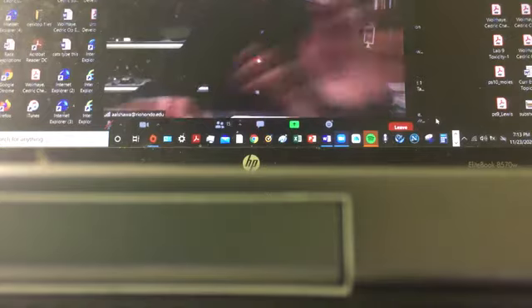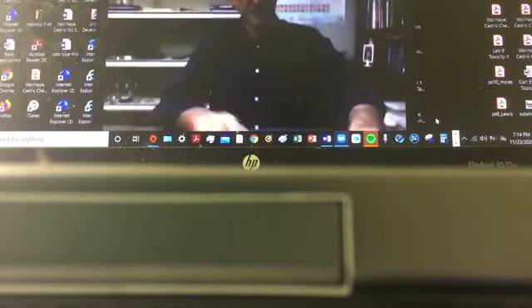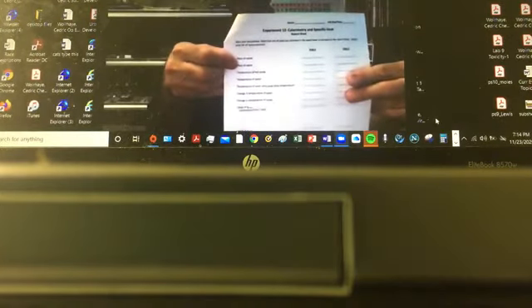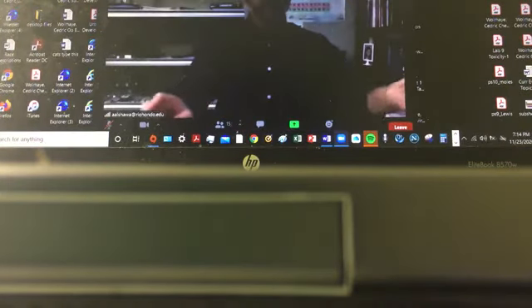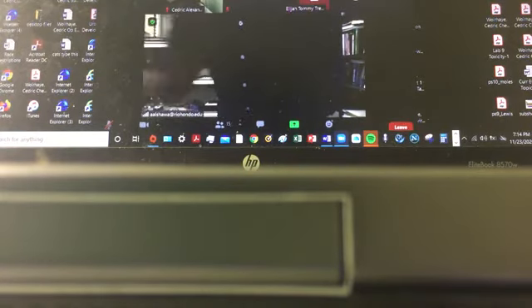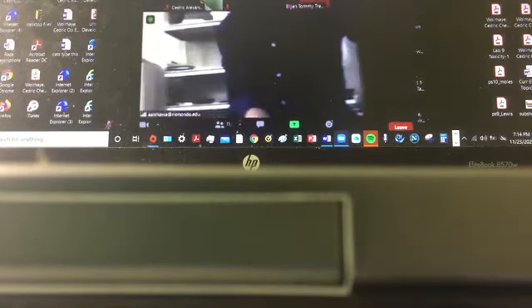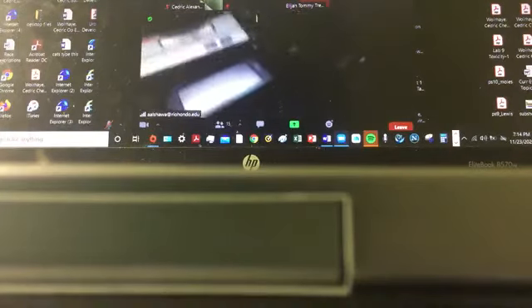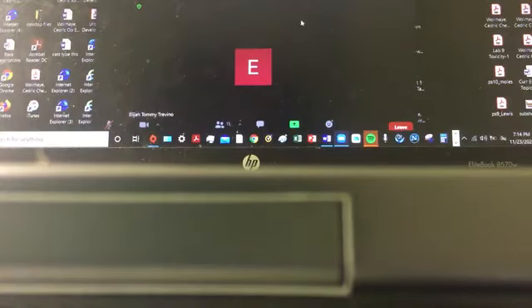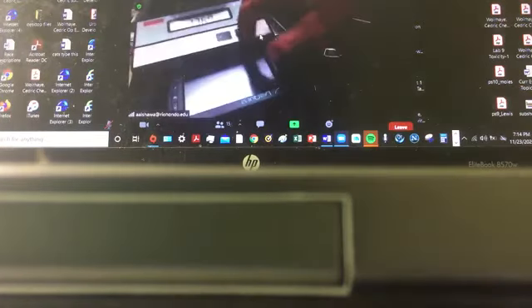All right, so back to the measurement. First, I want to measure any amount of metal. Let's decide on 50 grams. So just follow the measurements. Can you see that screen? I'm going to zero that screen.